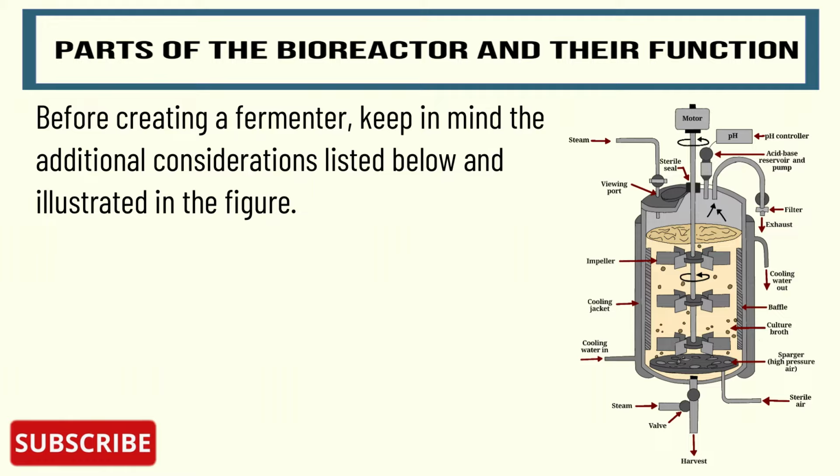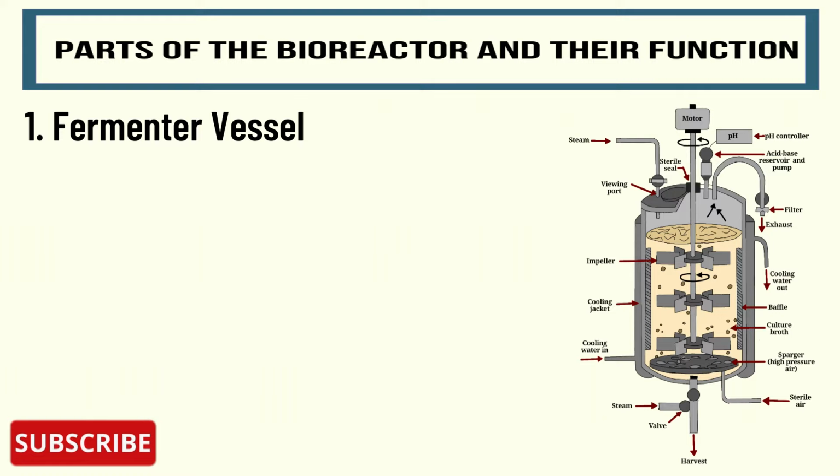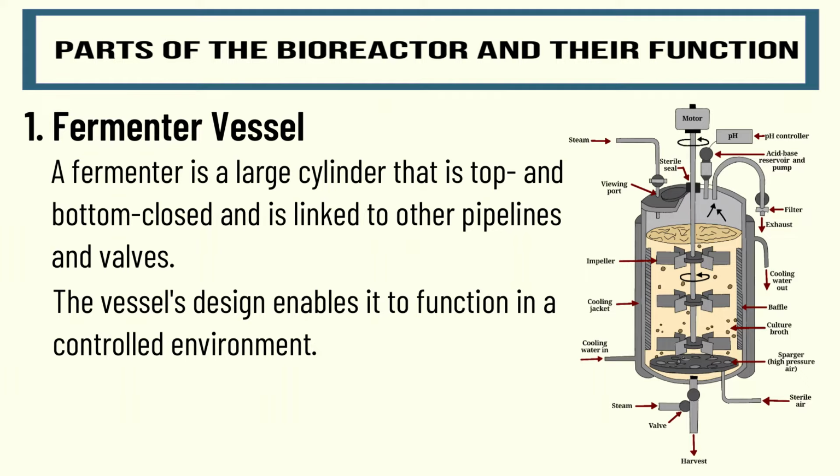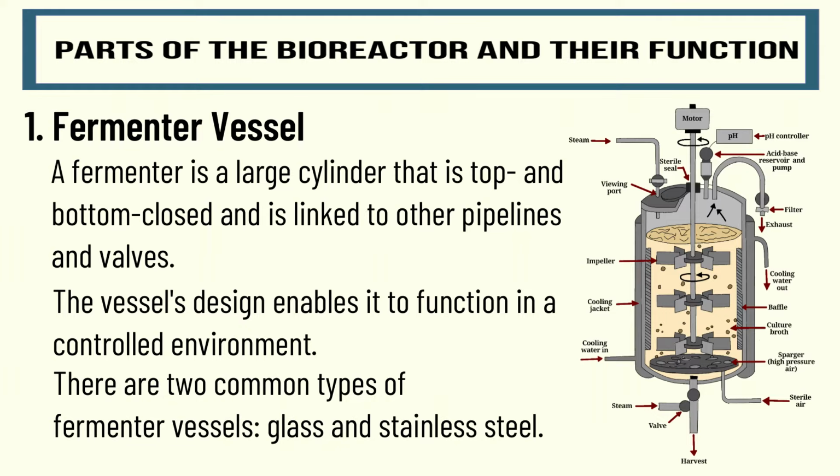First we have fermentator vessel. A fermentator vessel is a large cylinder that is closed at top and bottom and is linked to other pipelines and valves. The vessel's design enables it to function in a controlled environment. There are two common types of fermentator vessels, glass and stainless steel.